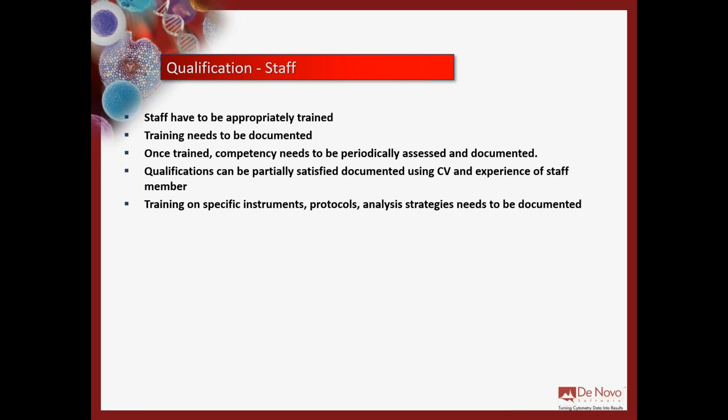But at that point, we would presume that you're familiar enough with your own assays and your own things that you would be able to write the PQ, and you can even model them off of either existing PQ quality procedure documents you have already in the lab, or the IQ and the OQ documents that we've provided you.